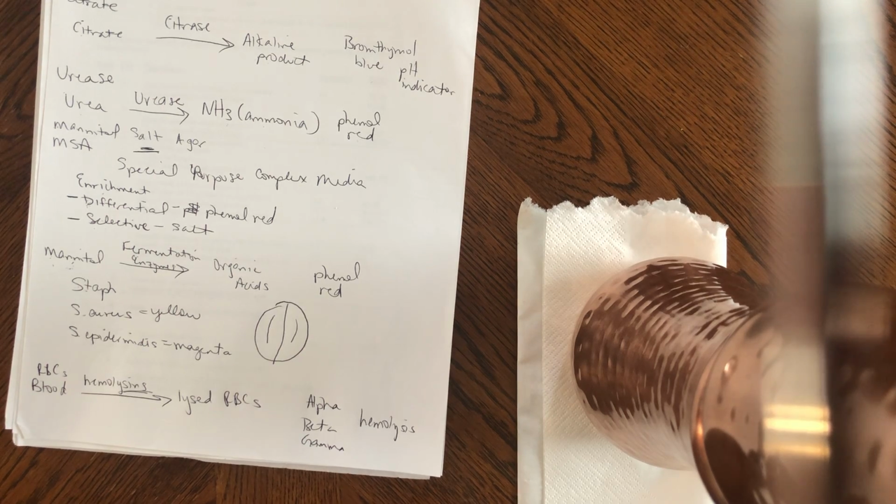So in a class of 20 or so, usually most people have alpha hemolytic bacteria in their throats. And there's different types of group of strep that live in our throats that are just naturally there. They're not causing any infection. They're not causing any disease. They're just normal flora for us. Alpha hemolytic bacteria can cause infection, not necessarily always in the throat. They can move from place to place.